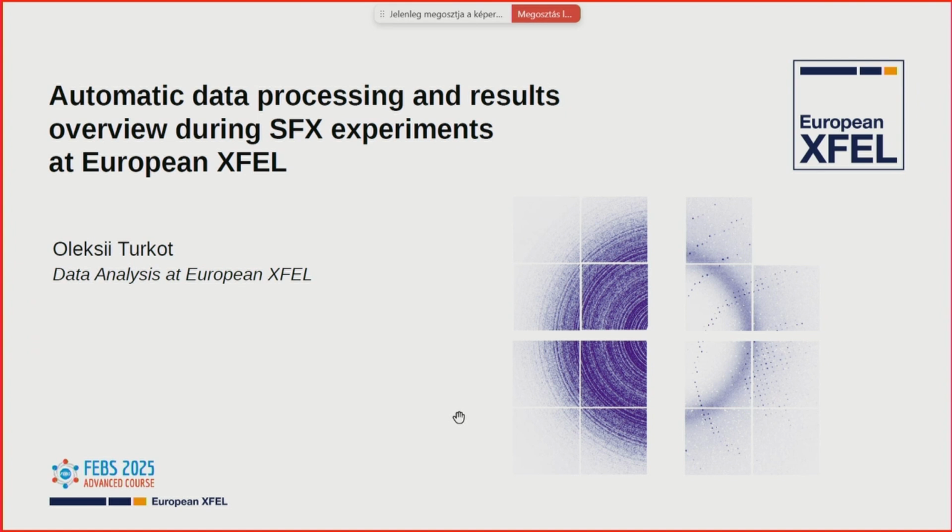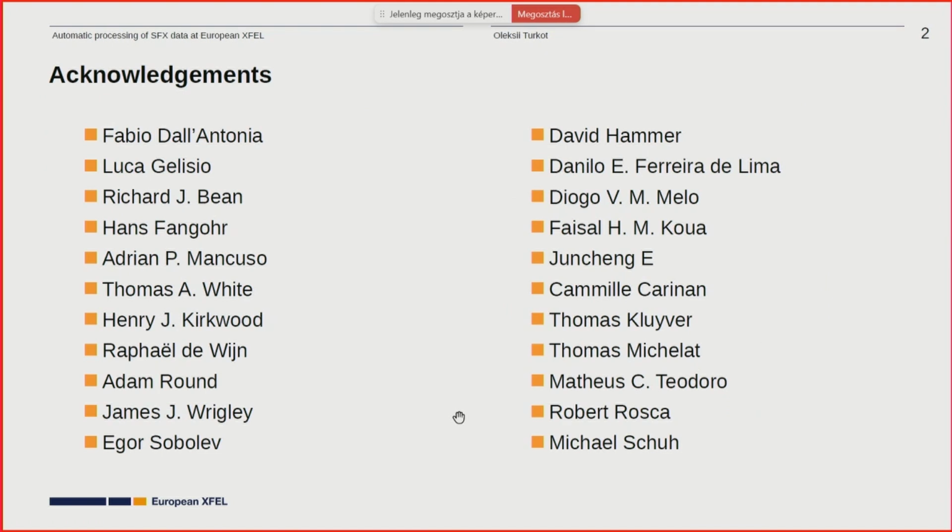I would like to present the tools which we have for automatic data processing and results overview during serial femtosecond crystallography experiments at European XFEL. I would like to say that the tools which I am showing here were developed in close collaboration with many people at European XFEL, but also with Tom White from DESY.